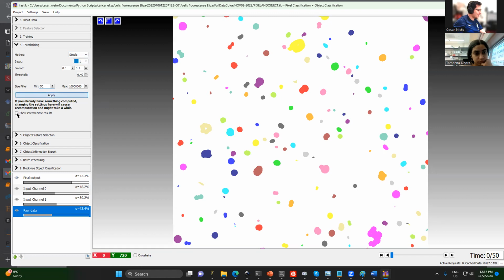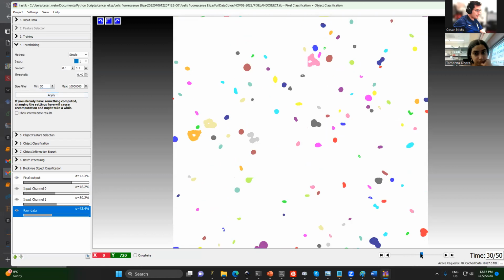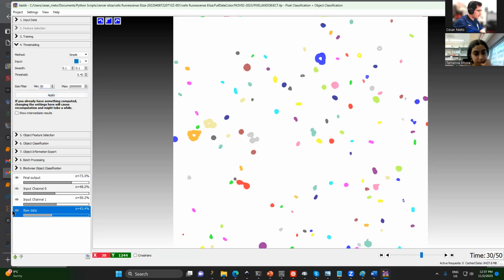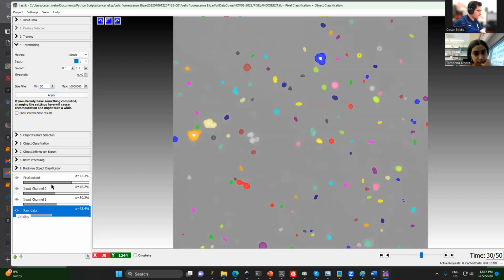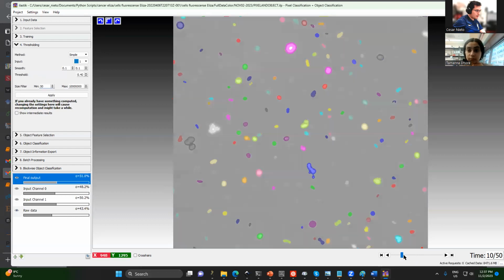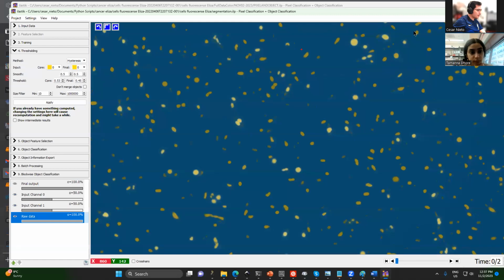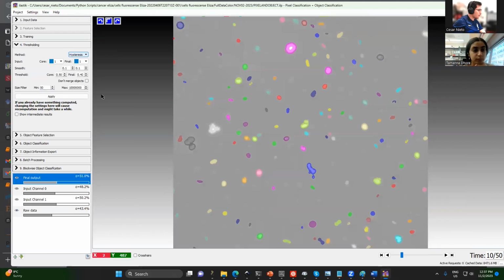It is detecting something. So why is this 50-40? Okay.